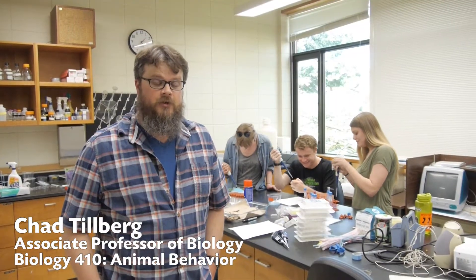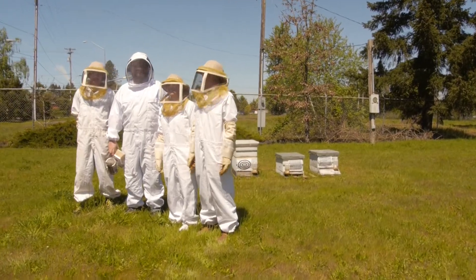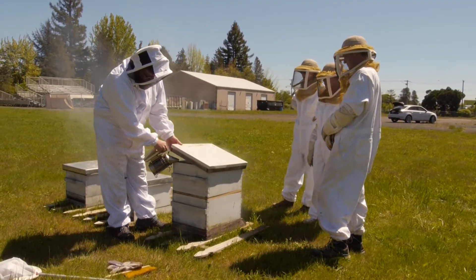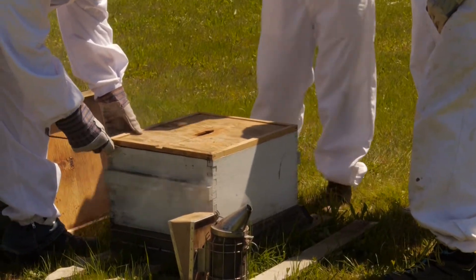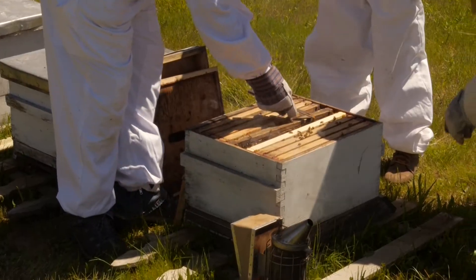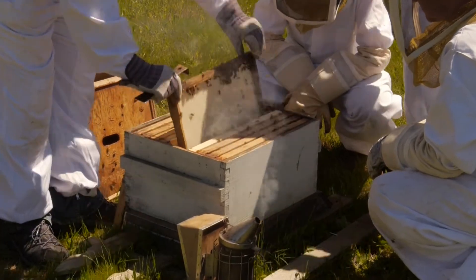We have a weekly lab that goes along with this class. What we're doing this week is going to test the sensory receptors of honeybees — specifically their taste receptors — by presenting them with different sugar kinds. We learned earlier in the semester about different kinds of sensory neurons and how they are perceived by the brain.